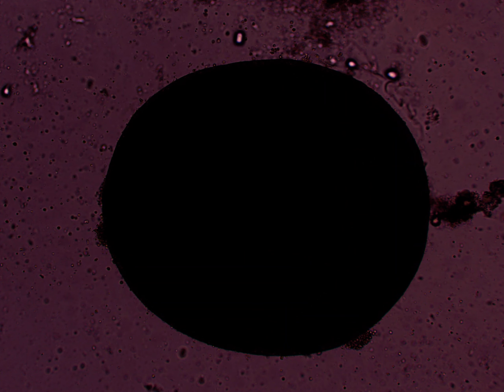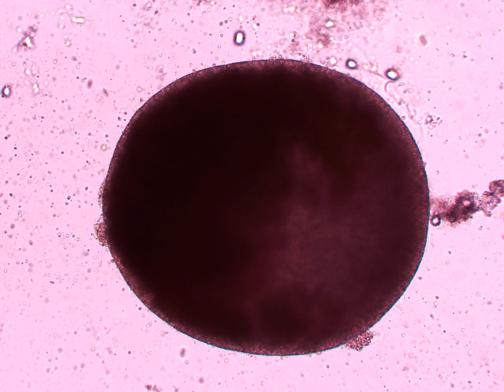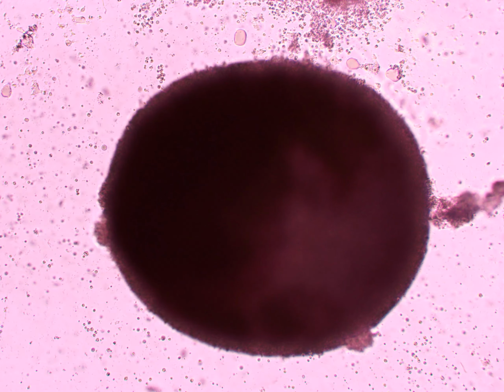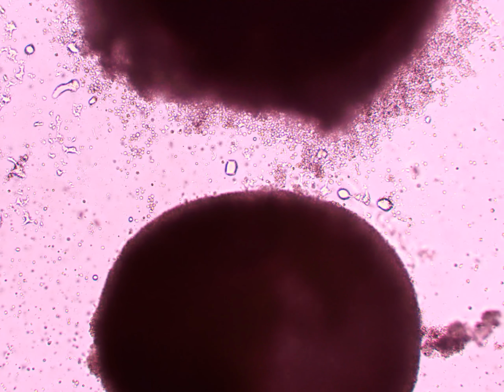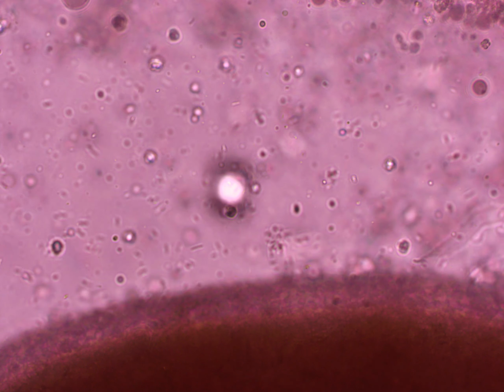Here, now you can see all of the bacteria attacking the shell. Well, it's more of a casing on Copepodite eggs than a shell like on other eggs of reptiliads or any other things that have shelled eggs. And here you can really see that bacteria. It's very congregated. It's a very large buildup.